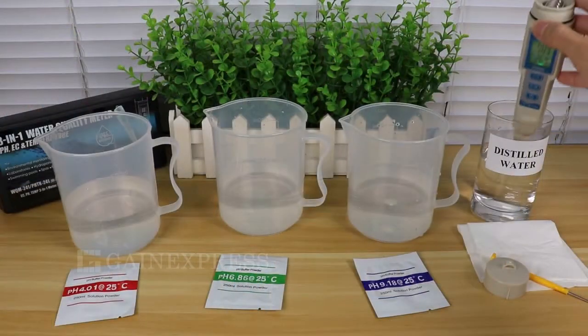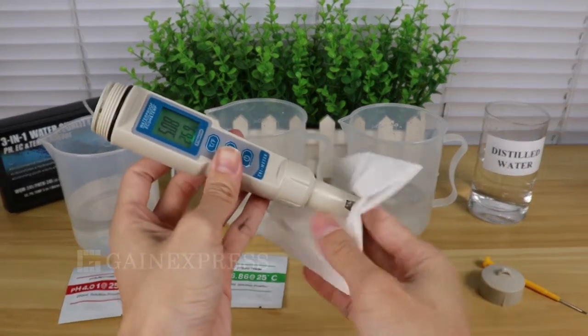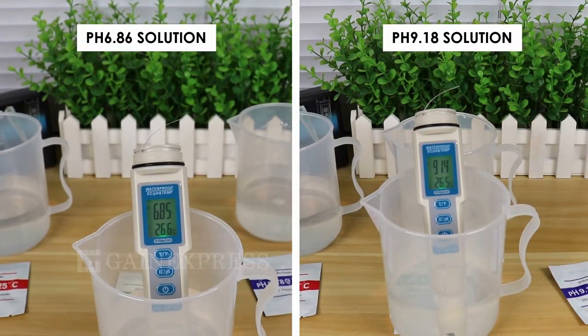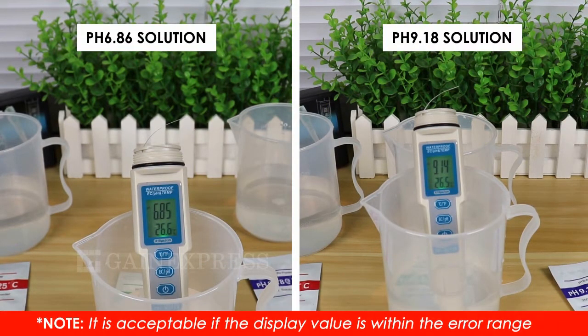Always rinse the meter with distilled water and dry with clean tissue after every use. Put the probe again into the 6.86 and 9.18 solution. Please note that it is acceptable if the display value is within the error range.